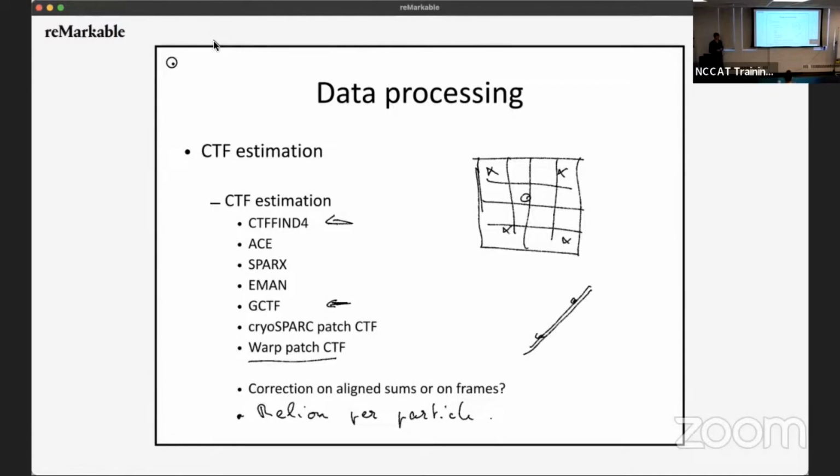And so you won't be able to get anywhere. Basically, the per particle CTF estimation in Relion, in CryoSPARC, everywhere, is done in a very local fashion, where you've already aligned your particle extremely well to your reference. You already have a reconstruction at 3-4 angstrom resolution. And now you're just doing a very local alignment of your particle, and trying to refine within a small range what the CTF value might be. And then in that case, you manage to get to a good global optimum.